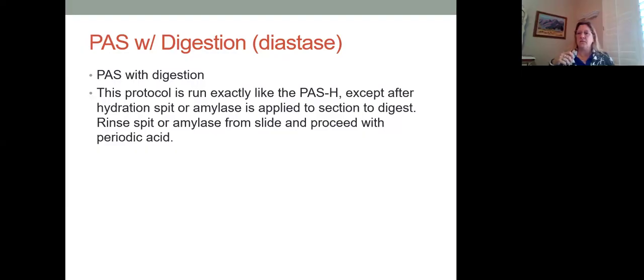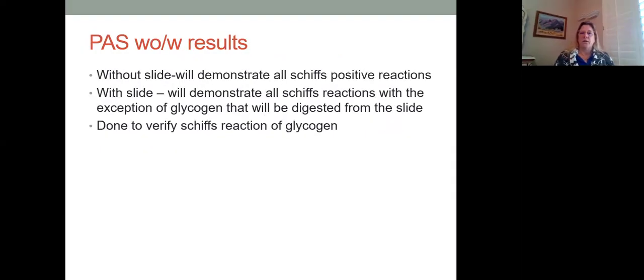In the old days, we used to just spit on the slide, and leave our spit on the slide to digest, because you have digestive enzymes in your mouth. That's what your spit is. So we used to just spit on the slide to use that as digestion. Oh, guess we just did that.